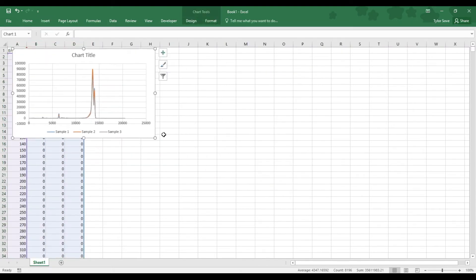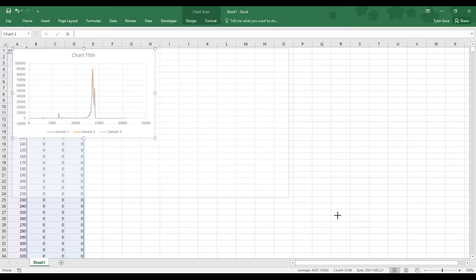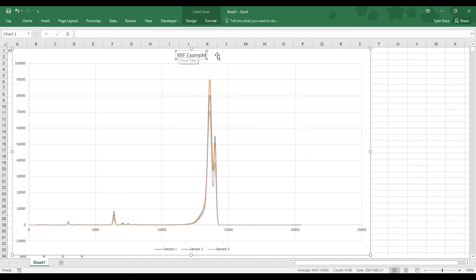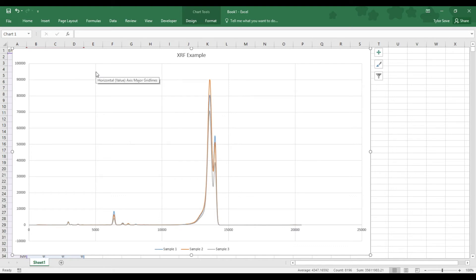I'm going to zoom in on this, because this graph needs a lot of work. First and foremost, it needs a title. Your graph title will probably be more appropriate than mine, probably XRF and then your sample name. Now we need to zoom in on the important data. The important data is this stuff way down over here.